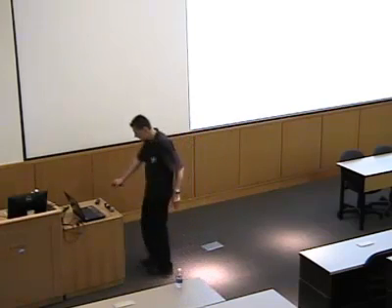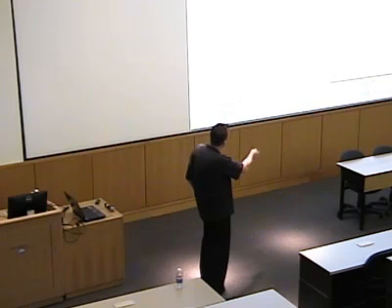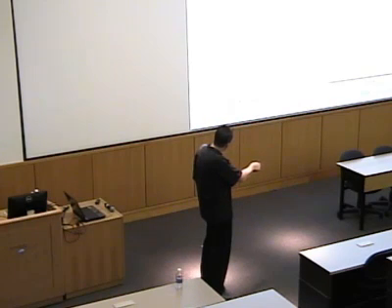Think about this logically. As you increase the field and lower the temperature, at some point you arrive at a situation where this upper level here is completely depopulated. All your molecules are now here, and no molecules are here. That means there is no more blue transition. There are no molecules in that state, so the blue curve is gone, and we only have the red curve. And if you take the difference, the red curve equals the green curve. So how can you get more intensity than that?